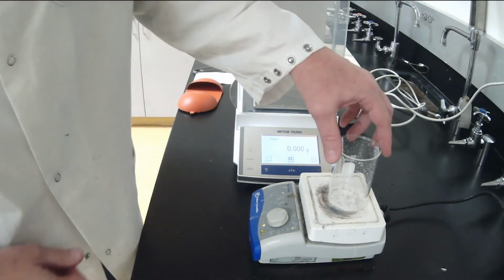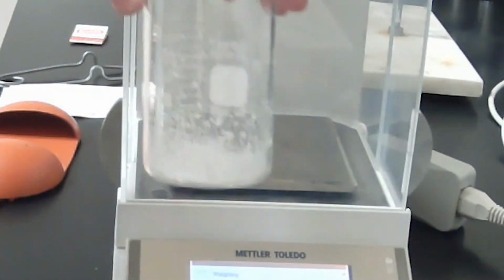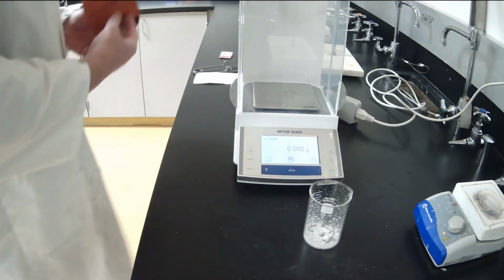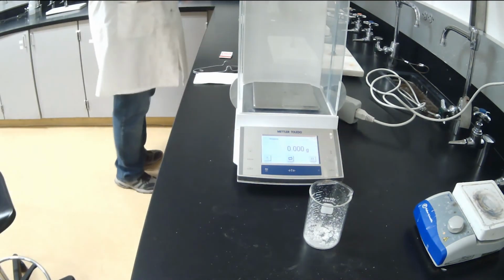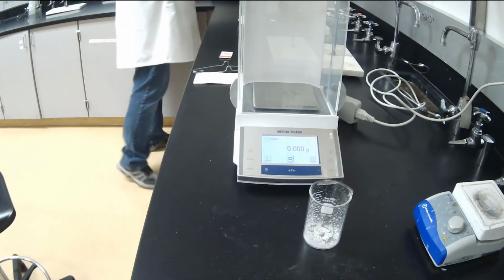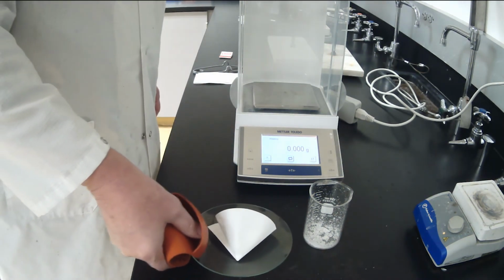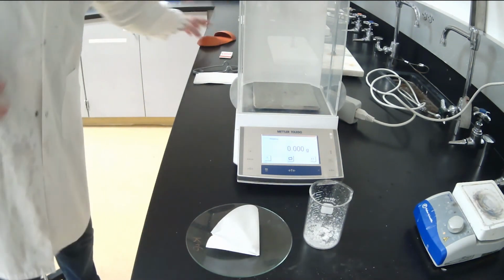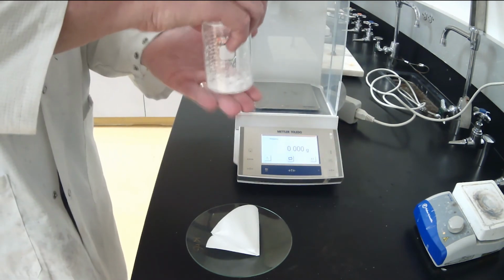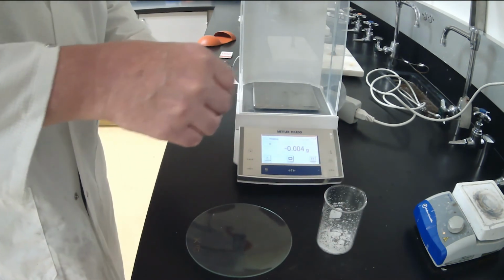Okay, it appears that the beaker has finished drying. There's no more water droplets easily visible. So we're now going to just set this down for a moment to cool. And while that's cooling, we can go over to the oven and retrieve our filter paper in our pan, and it should be nice and dry also. We're going to put that right there. Now these cool off fairly quickly because there's no liquid inside. Yep, that one's about ready. Yep. And this one, all nice and dry.